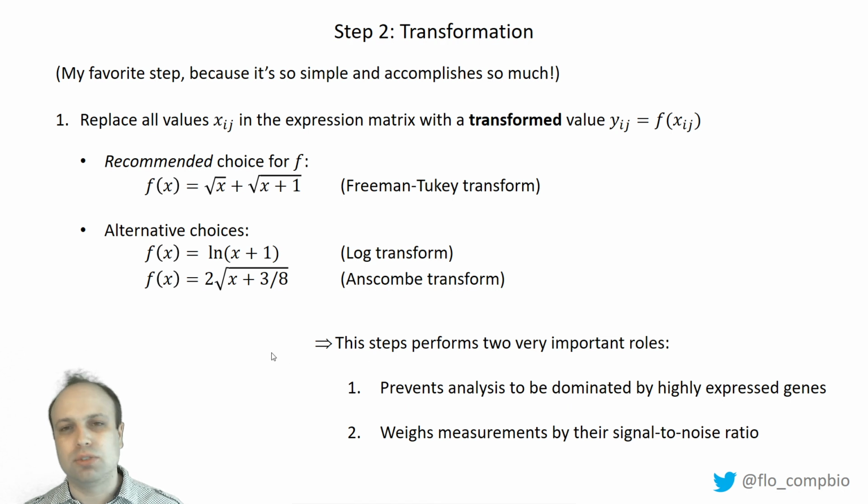We don't want that. What's the point of measuring all the genes if in the end the PCA is driven by 5 genes or something? That doesn't make any sense. So we want to squish the high expression values a little bit. Obviously the log compresses the high values a lot more than the square root, but both of them basically downweight the highly expressed genes, or make them smaller, so that the slightly less highly expressed genes get a chance.